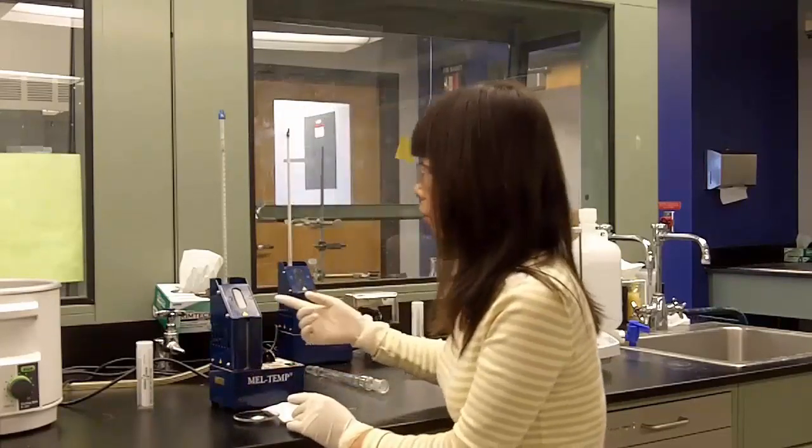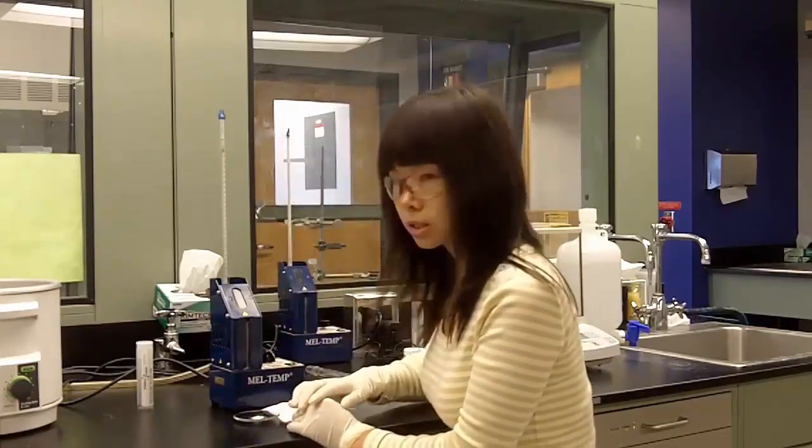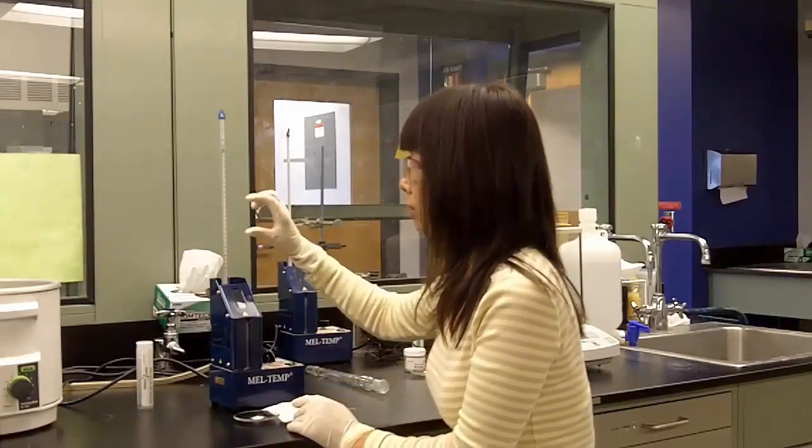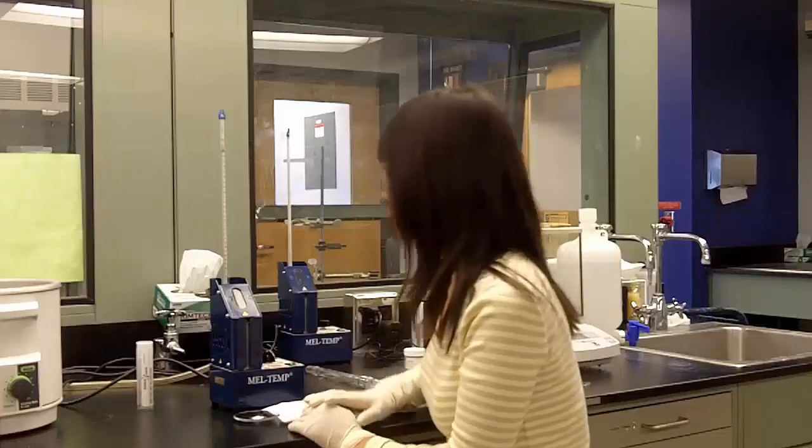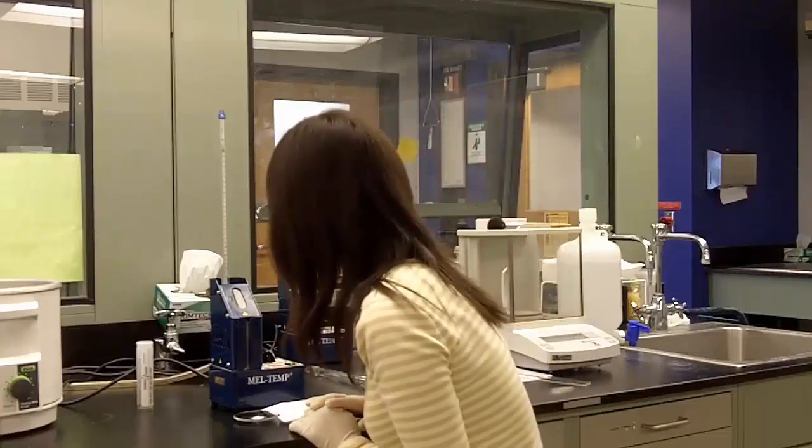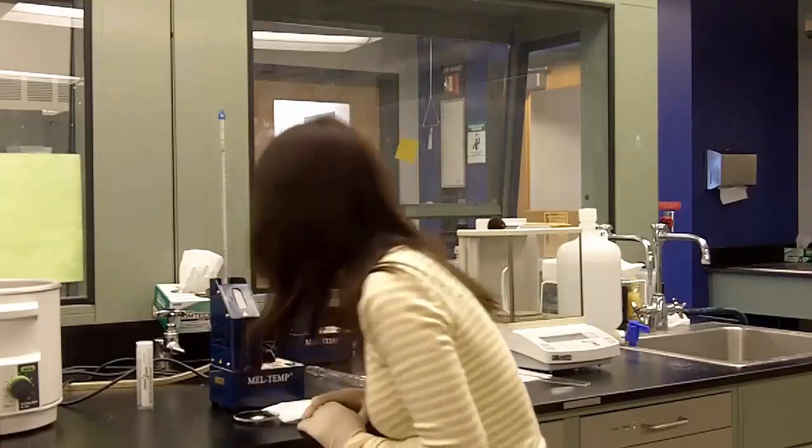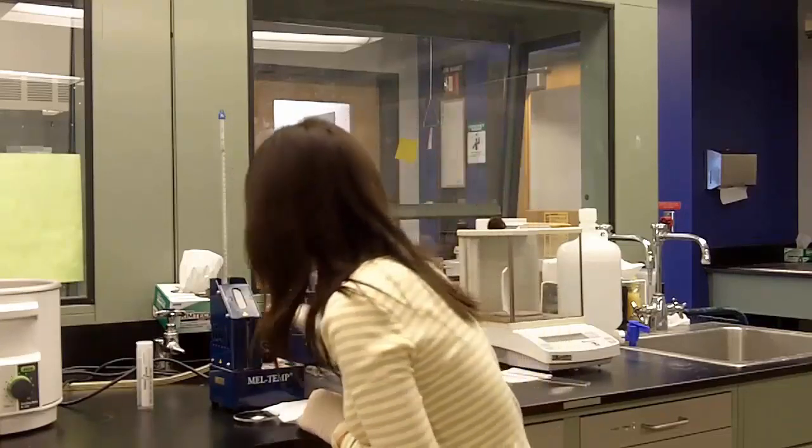Since this is an unknown sample, we don't know if it's going to melt at 60 degrees or 200 degrees. So a rough melting point is necessary to help you narrow down the melting range. And the temperature is rising very fast. And now it's about 60 degrees and the sample is still solid, so we're going to keep watching.